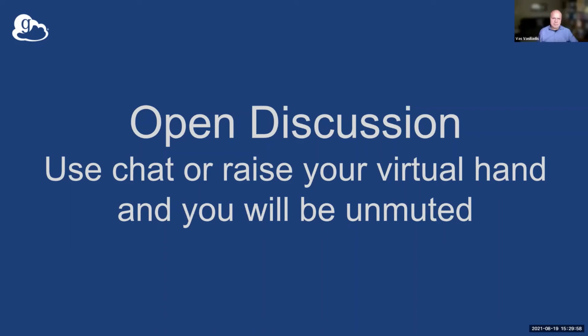Is that possible? Yeah, so you mentioned a couple of different ways. The more common one, I would say, is installing Globus Connect Personal and creating a shared collection, as we call it. And so you can have the structure automatically created with the instrument, where the capture software is creating some structure.